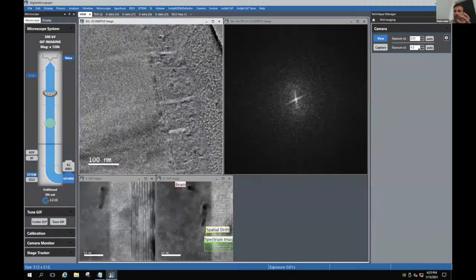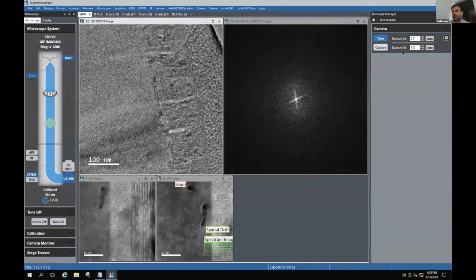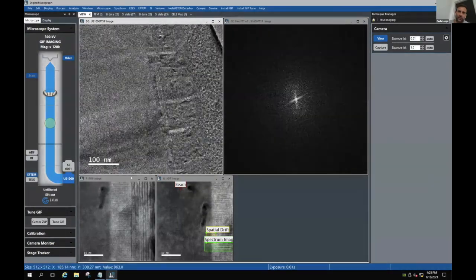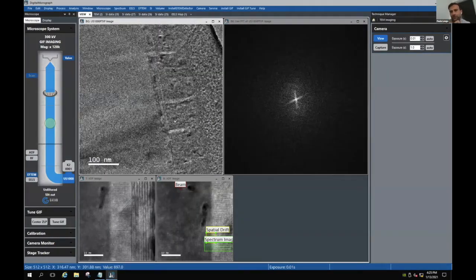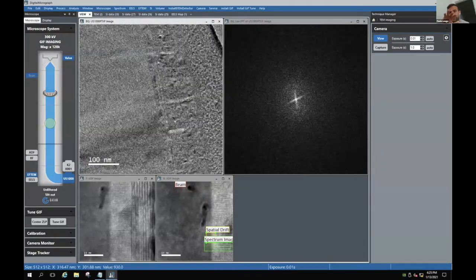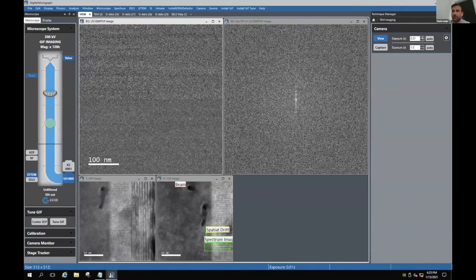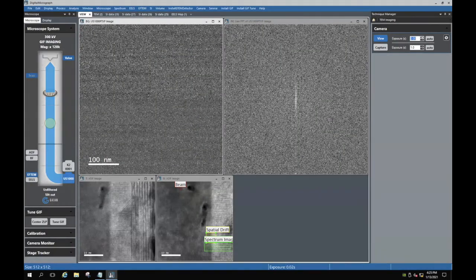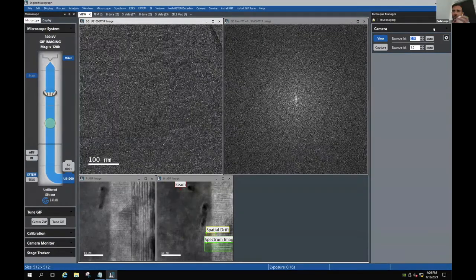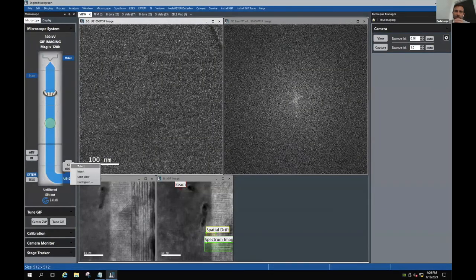We could grab an image, say like you want to grab an image over like second. Actually, no, let's not do that. Let's switch to the K2 at this point. Let's reduce the intensity. Spread the beam. I mean, right now we are pretty high dose conditional. Let's spread the beam to the point that, well, there we have no image on the K2 on the US 1000. We still see something. Okay, good. Let's save it like this. So let's put the K2 now.